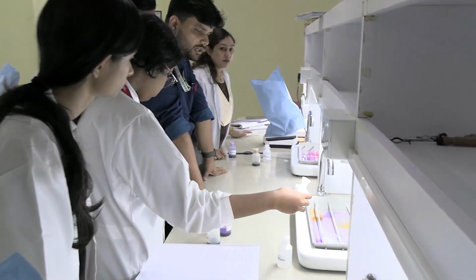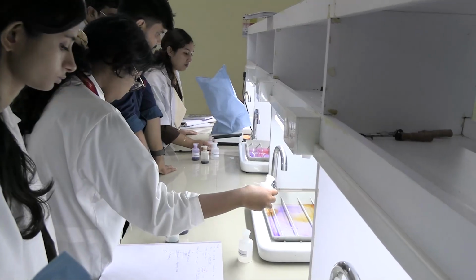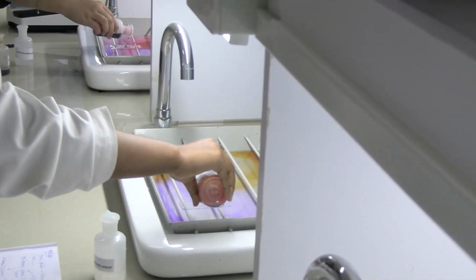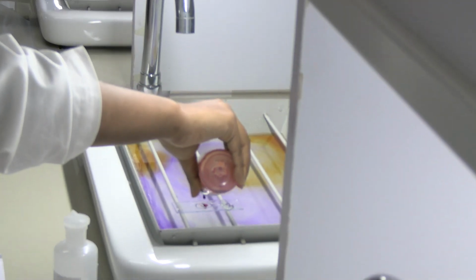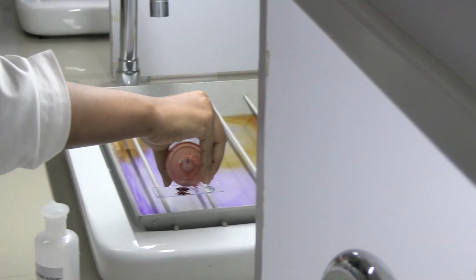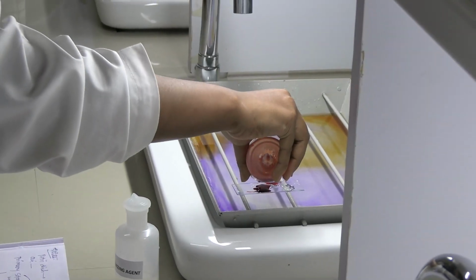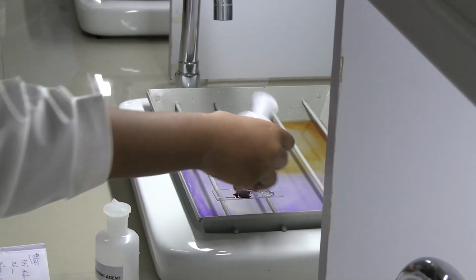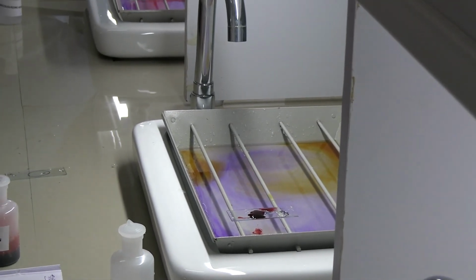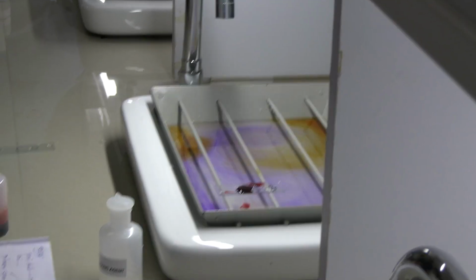The same thing. You're gonna flood the smear, not the whole slide. Okay. 30 seconds. You can start whenever you want. You're gonna squeeze the bottle. Squeeze it hard now. There's no issue. We have enough safranin. Okay, I think that's enough. Is this okay? So you're gonna wait for 30 seconds and then what do we do?